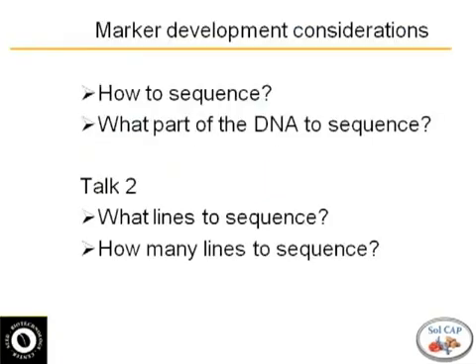So I have the first talk, and I'm going to talk about sequencing technologies. As breeders, you don't have to think about sequencing technologies so much, but I think it's important that you understand the differences between them, because that really qualifies the type of data that comes out. And that's what I want to relay today, because not all sequences are the same, as you know. So how to sequence, or what are the new technologies that are coming out?